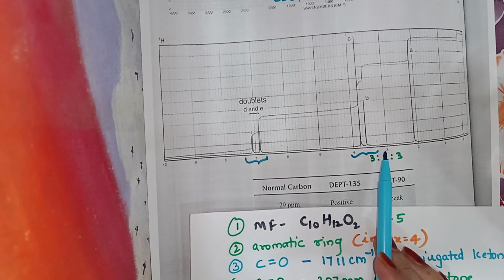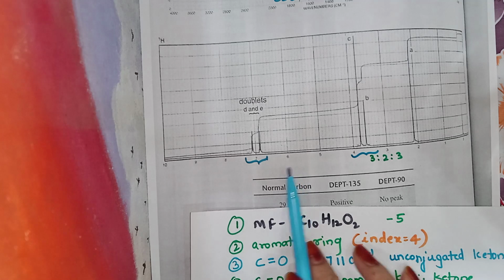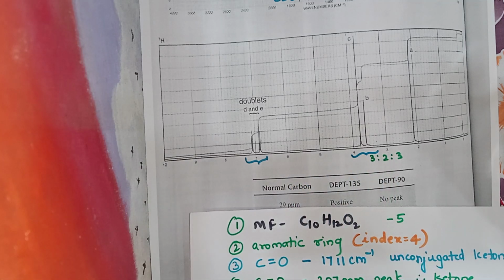Peaks are also unsplit, which indicates no neighboring protons are present.